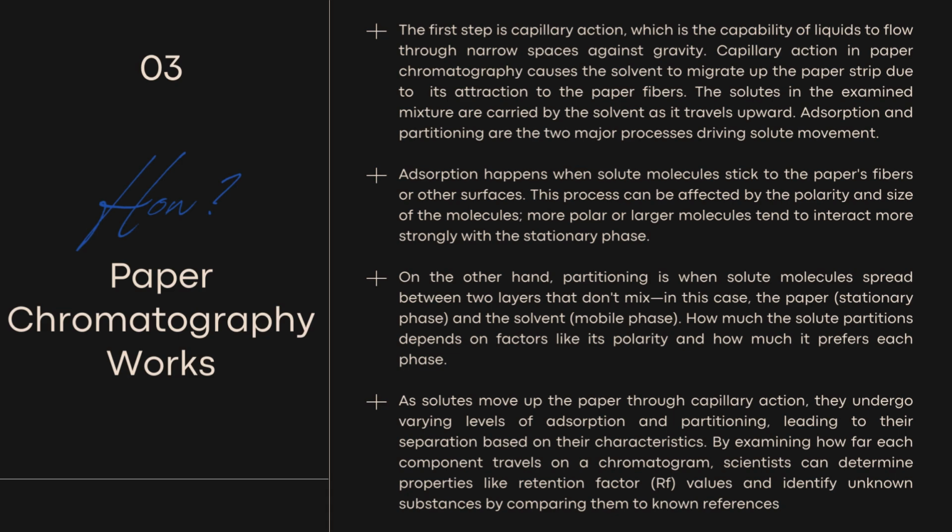On the other hand, partitioning is when solute molecules spread between two layers that don't mix, in this case, the paper stationary phase and the solvent mobile phase. How much the solute partitions depends on factors like its polarity and how much it prefers each phase.